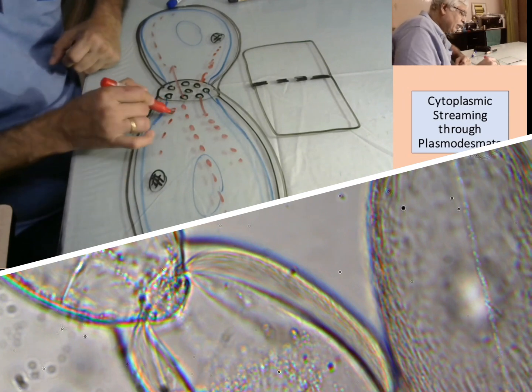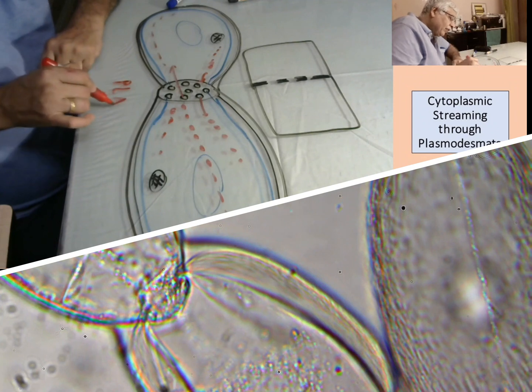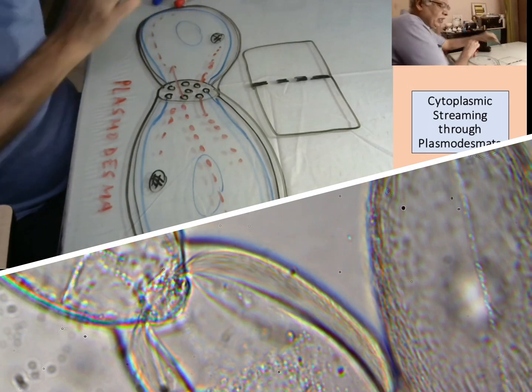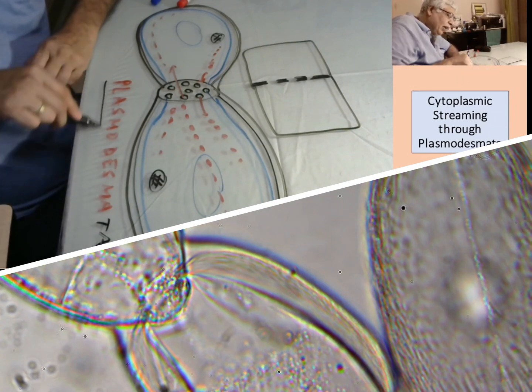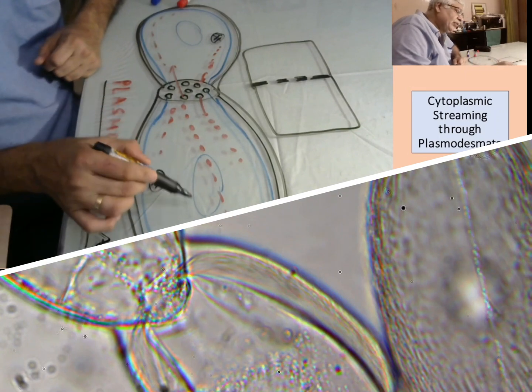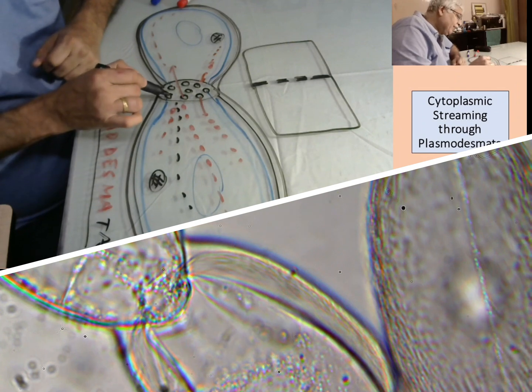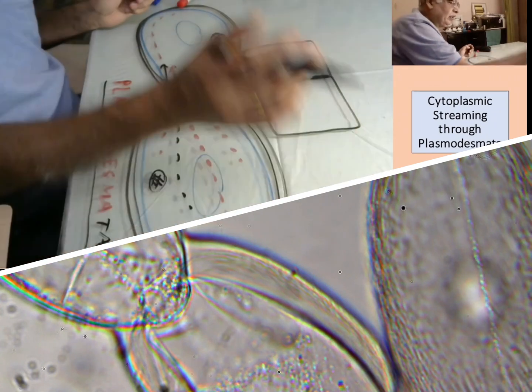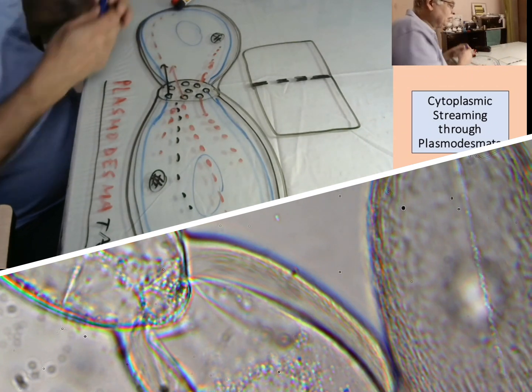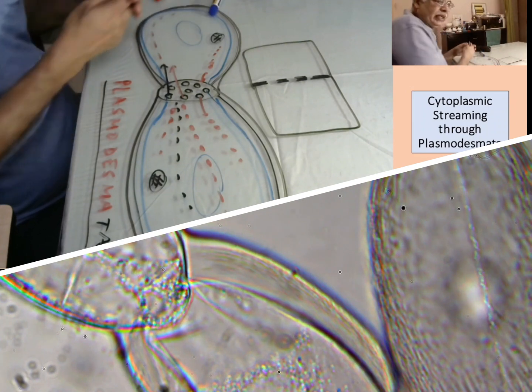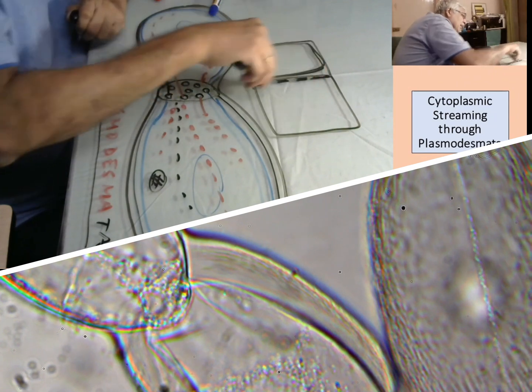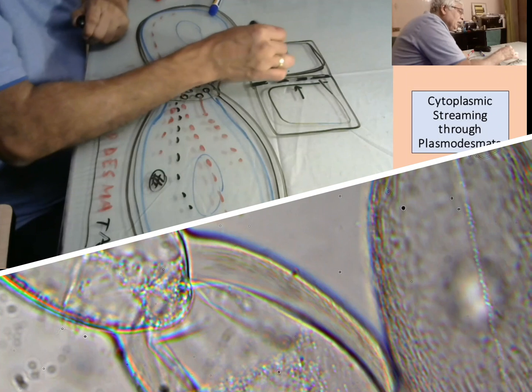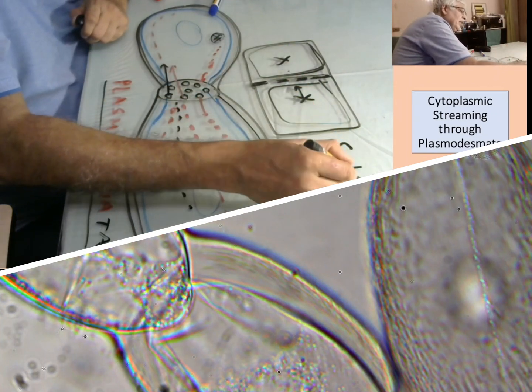Cytoplasmic streaming going through the wall is known as plasmodesmata — plural is plasmodesmata, just as stoma and stomata. Plasmodesmata is very rarely seen, but in this case when you see cytoplasmic streaming look carefully — you will see it is going through a passage from one cell to another. This continues from one cell to the third, fourth, and then we come to xylem or some sclerenchyma cell where, due to suberin and lignin formation, the plasmodesmata gets totally clogged, so no food can go from one cell to another and these cells die at maturity, such as sclerenchyma.